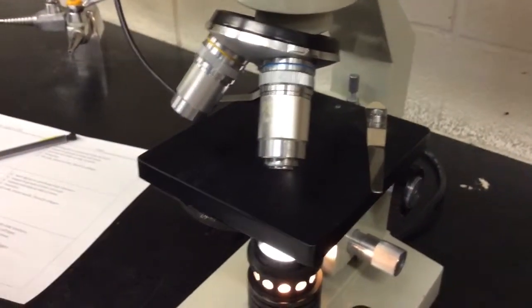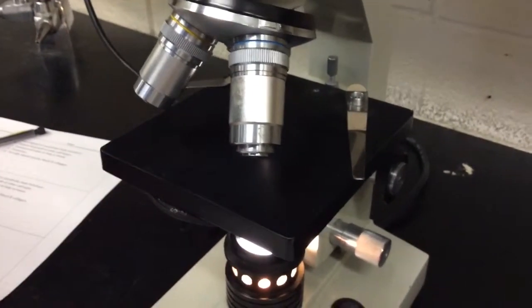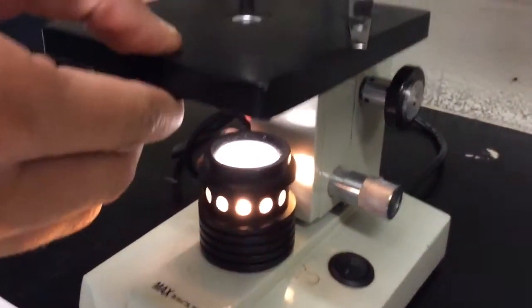Where should the stage be when you first start focusing? In the bottom, like down. All the way down? Sure. And how would you do that? With this thing. The coarse adjustment knob.